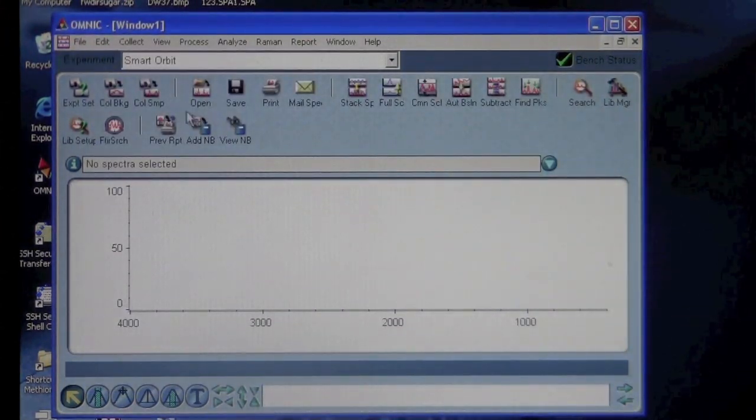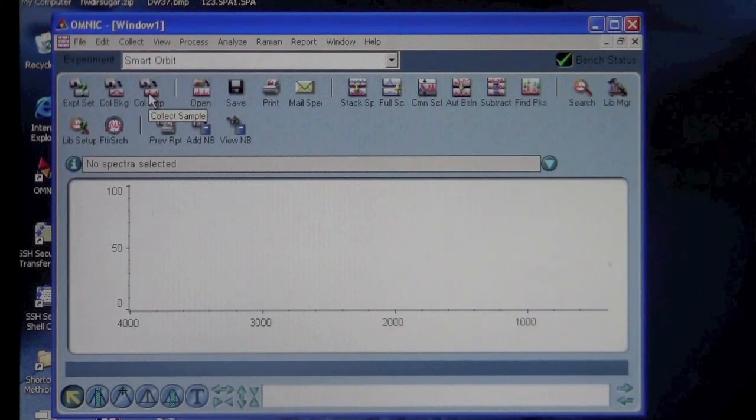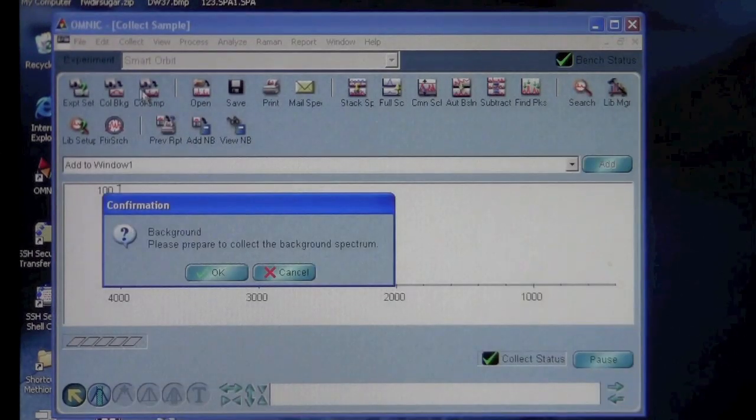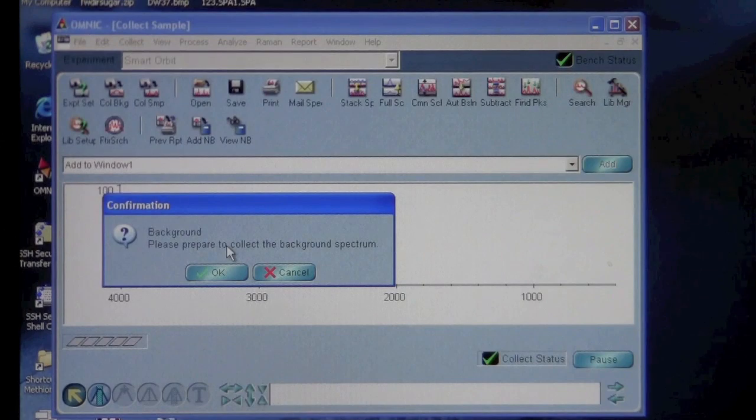Then to collect the data, you want to click on Collect Sample. You do not need to collect background if it's set to collect a background before every sample. We can just click on Collect Sample and it will tell us to collect the background. Over here on the instrument, before we click OK, we want to make sure it's ready for the background.